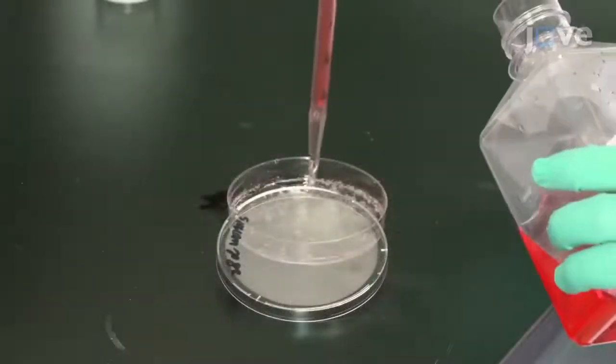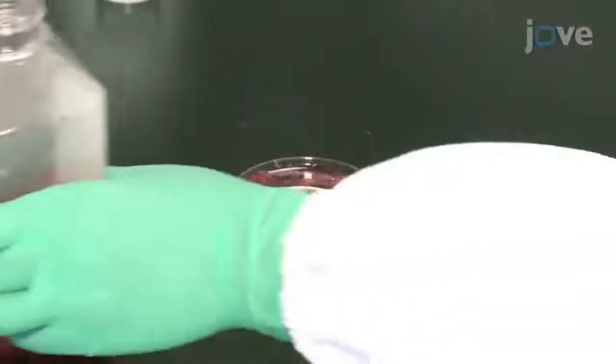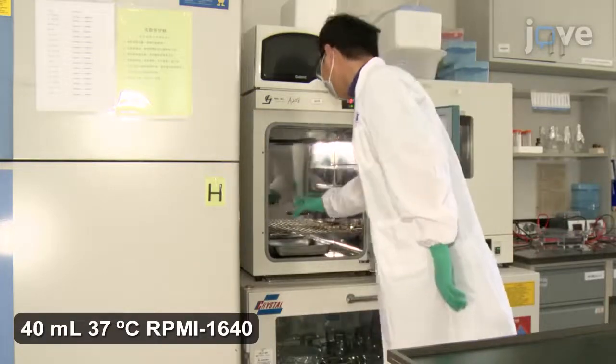Replace the second wash with 40 mL of medium without antibiotics. Then culture the parasites at 37 degrees Celsius under 5% carbon dioxide for two hours.